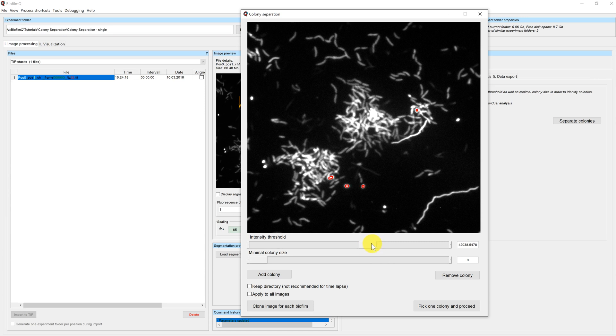In this case, we want to select a threshold where both microcolonies are part of the selection.